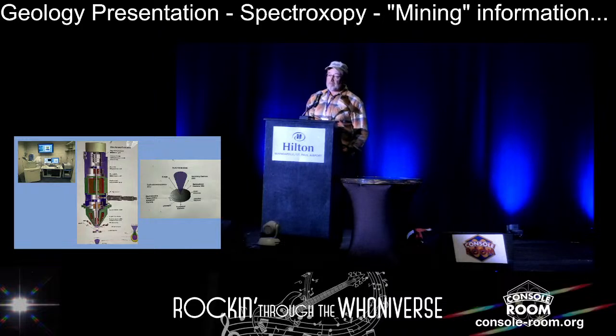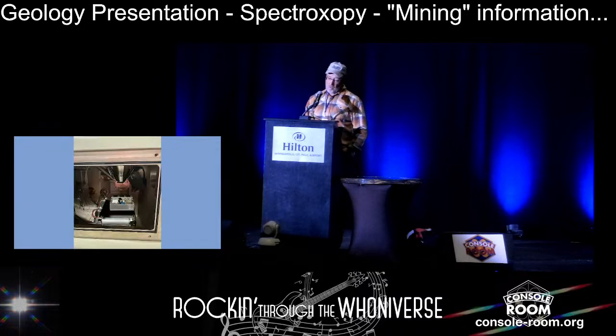And so we use a different computer to run the X-rays, and I'll show you that in a little bit. So here's a picture of the chamber. This is the sample that's in there right now. This is a specialized holder that we had from JEOL, Japanese Electronics Limited, a wonderful company, wonderful machine, and we have like 300 service guys available to us, which is quite nice.